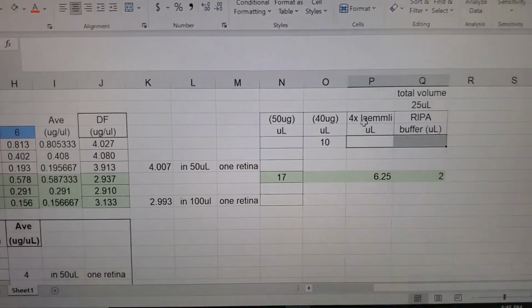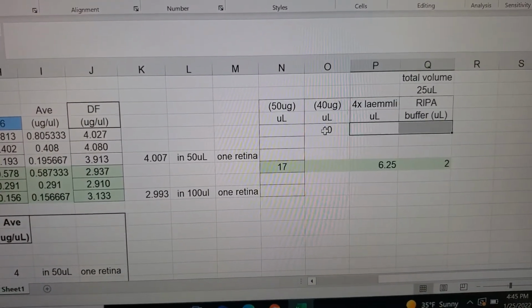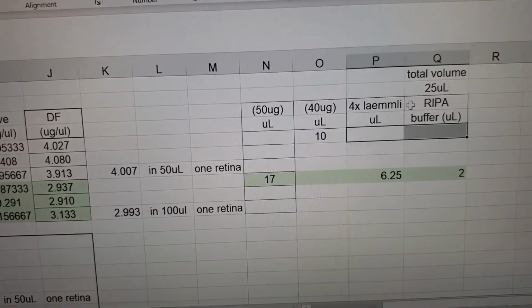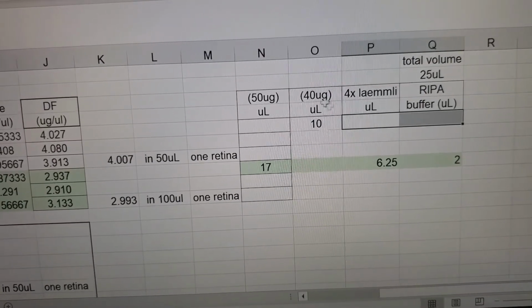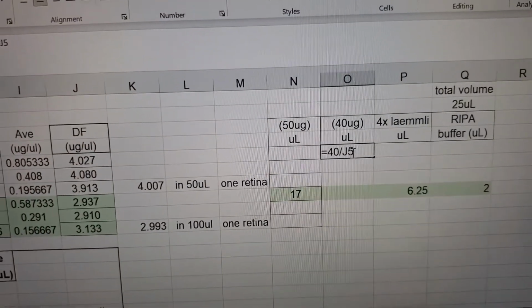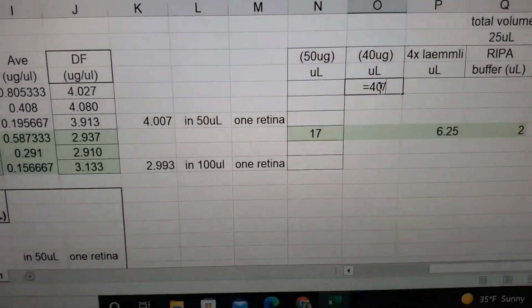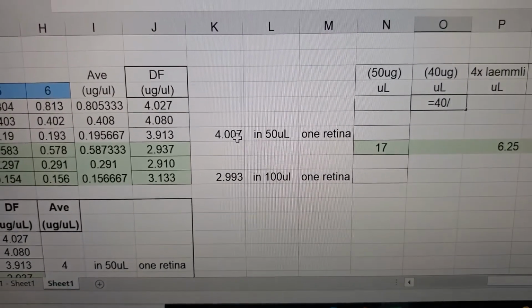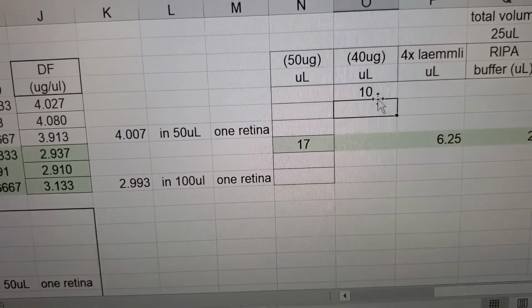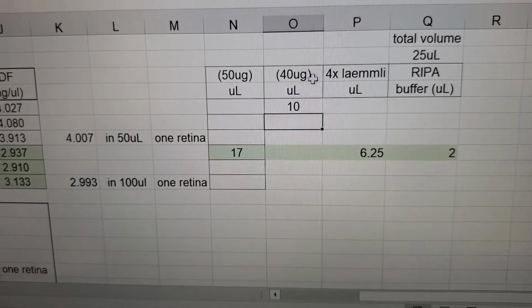One more time, I'm now going to explain my calculations for my second sample, in which I'm going to prepare 25 microliters that contain a total amount of 40 micrograms of protein. So in order to do that, we do equals 40 micrograms divided by our average concentration, in micrograms per microliter. So that comes to 10 microliters of our lysate sample that will have 40 micrograms.